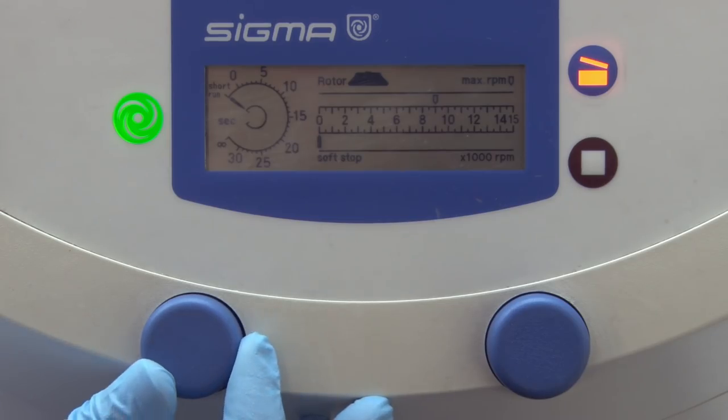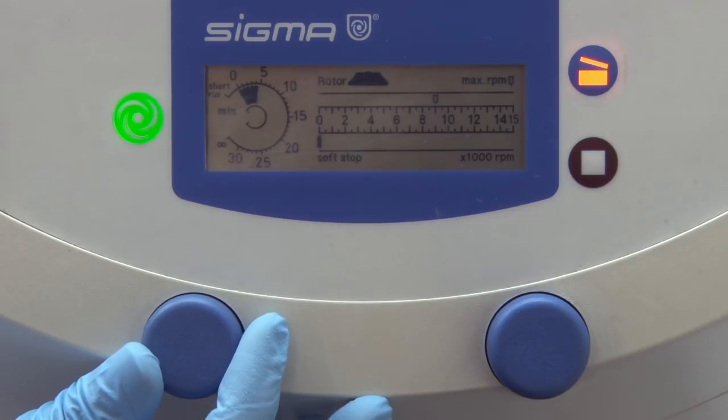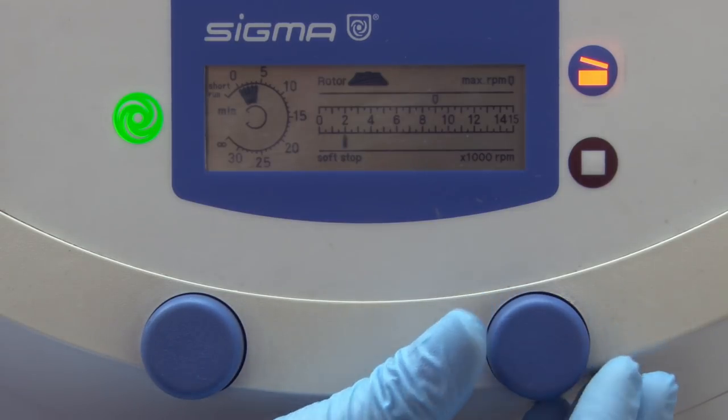Spin the sample at 1800 rpm for 4 minutes. Be careful not to overspin or the cells will be damaged.